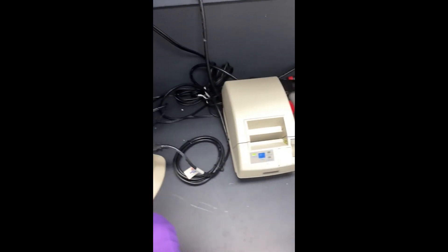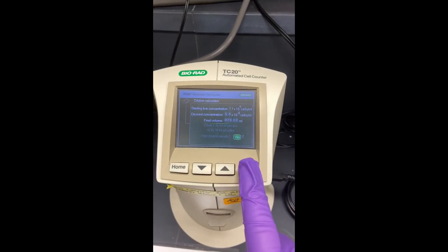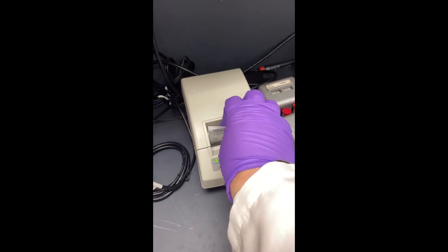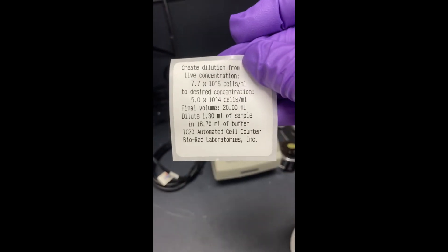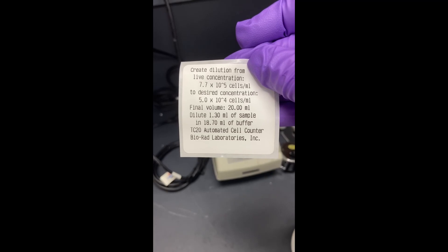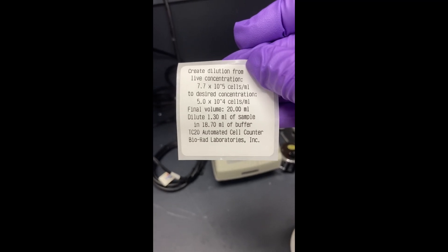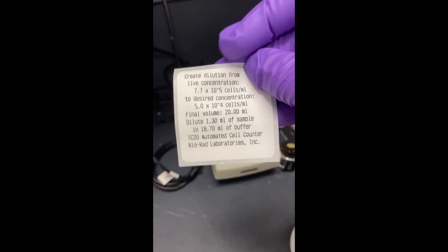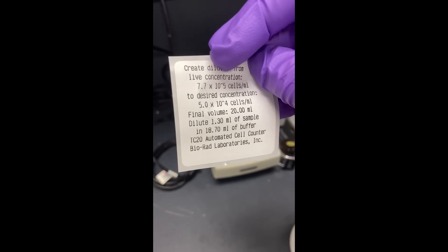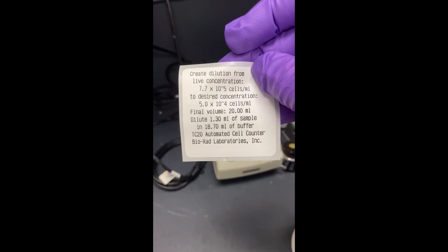And we do have a printer hooked up to this instrument. So it actually is really nice for record keeping to print out your dilution so you know how much you put in, if there's ever a question in your calculations or whatnot. And this is on a little sticky thing so you can stick it right in your notebook.